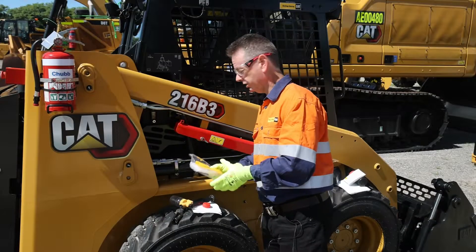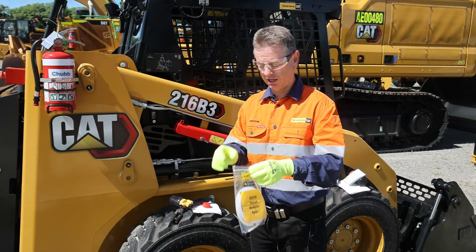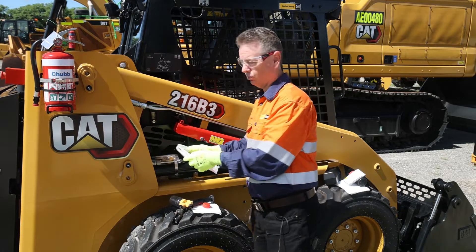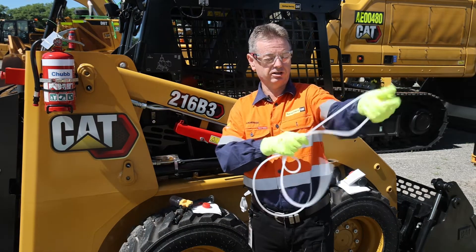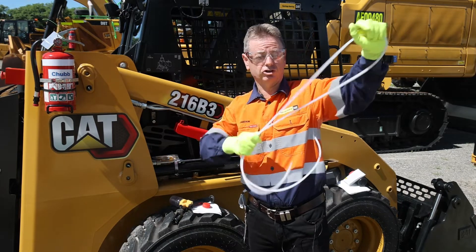We're going to need to add the tubing. The tubing is supplied with the kit, so we take it out of the bag. It's always nicely wound up, so we need to stretch it out as best we can to get it nice and straight so we can actually put it in the machine.